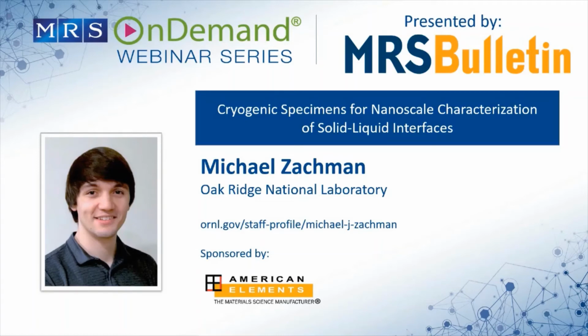But when you're using a high energy, for example, in the microscope, and most of the energy passes right through the sample, you're not depositing all that. So heating is not that dramatic. But the ion beam damage question is a very important one, especially for these beam-sensitive materials. I also think it's not very well explored yet because it's more difficult.